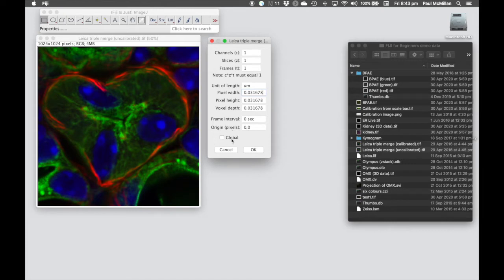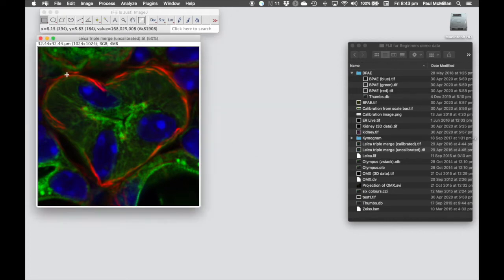If I hit the Global button, that will apply the calibration to all images open within Fiji, so be very careful using that. Once I hit OK, you'll see we now have the physical distance of the image as well as the number of pixels it's made up of.